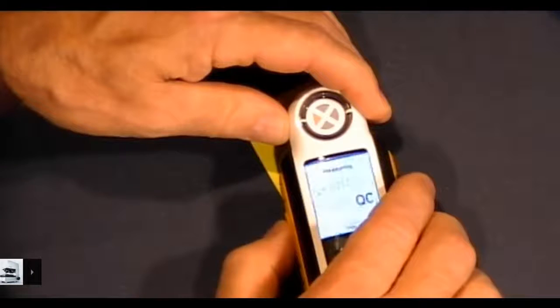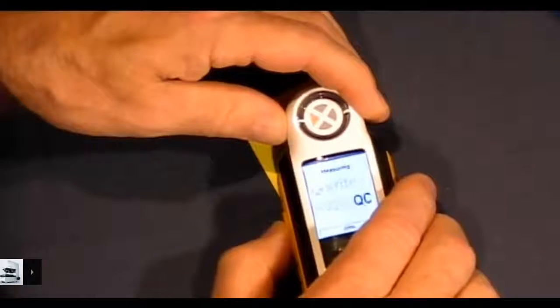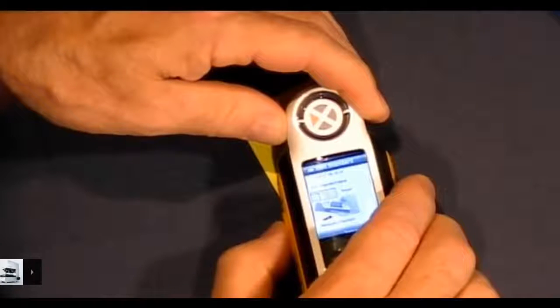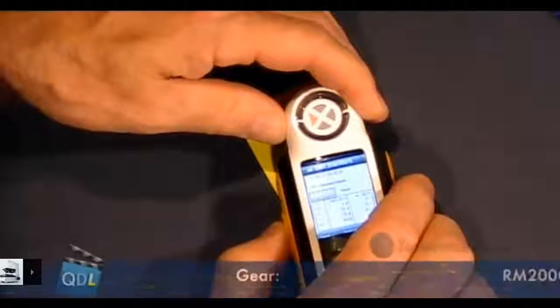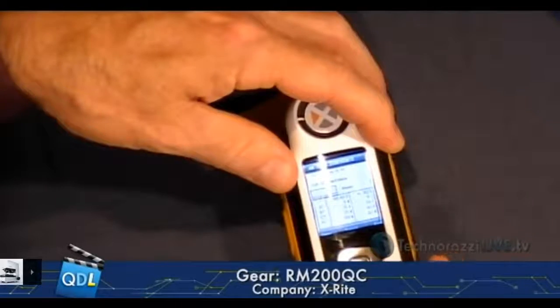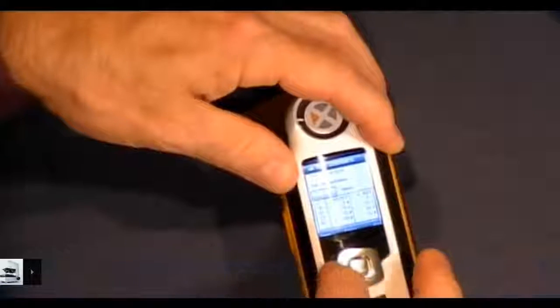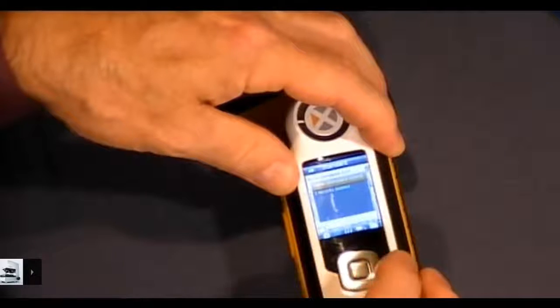So now we're going to take our measurements. There's our first measurement. Hey, no error message. There's our second measurement. And here is our third measurement. It will average those, and here are some details on those measurements, what the color attributes actually are. And now our standard is there. All I have to do is save it, tell it yes, and our standard is good to go.